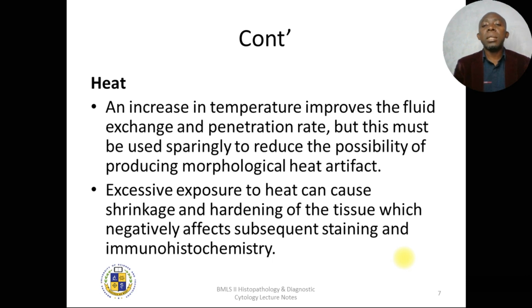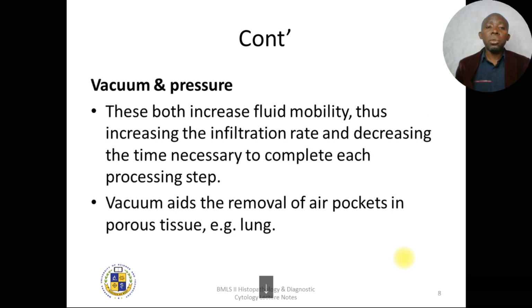Heat increases the movement of the molecules and atoms in the fluid, and whenever there is an increase in mobility, it also increases the rate at which they can penetrate the tissue, for easier processing.